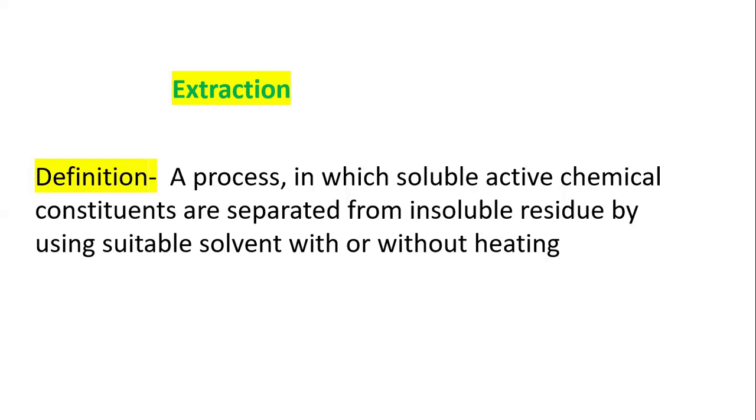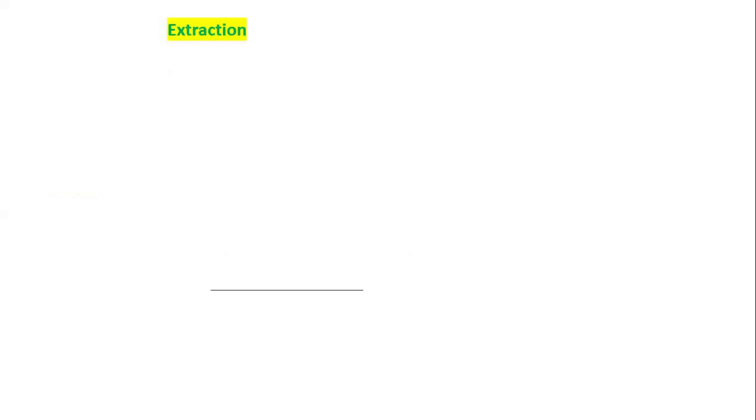So we are going to separate that active chemical component when we dip it in a particular solvent, where the dissolved chemical components are released into that solvent. When we filter this, they are separated, and on the filter paper the residue is obtained. So in this, we separate the active chemical components. Okay, just see in a diagrammatic presentation.